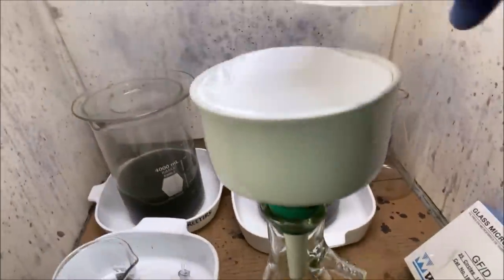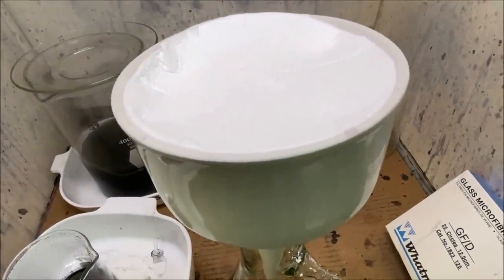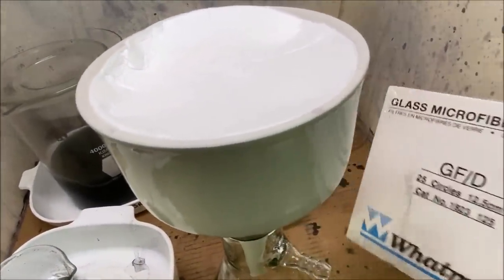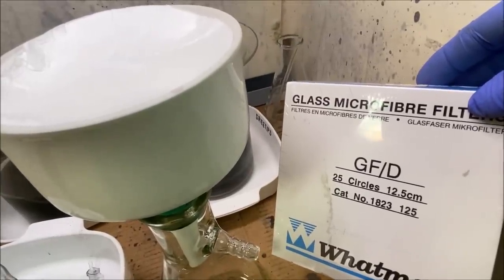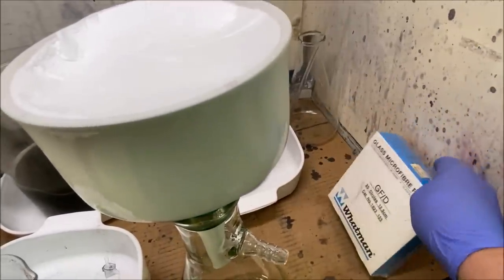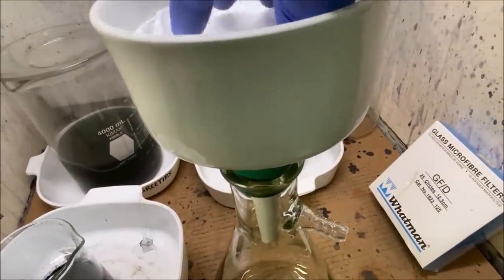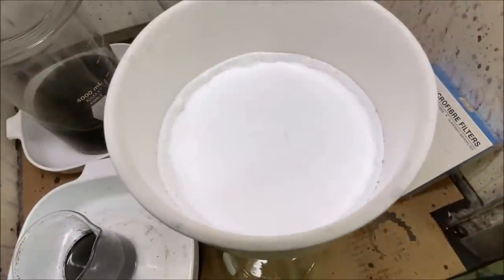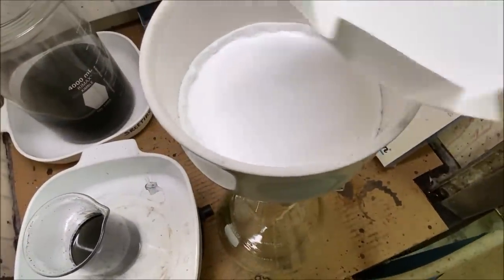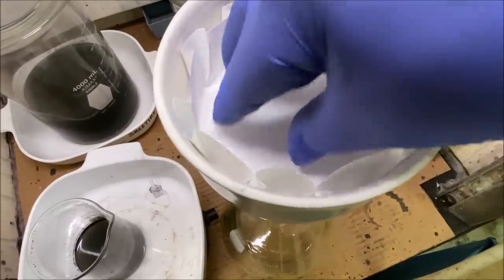I've got two filters up here. This one is a fiberglass microfiber filter. Sulfuric acid should not affect this filter that I'm pushing down in here. This is the microfiber glass filter. I've got that filter seated down into the Buchner funnel. I'm going to follow it with a regular paper filter.